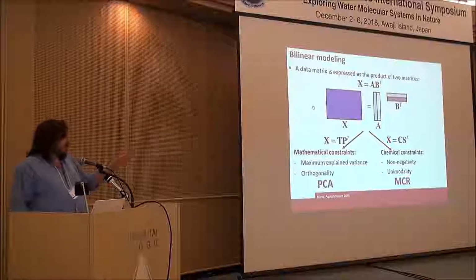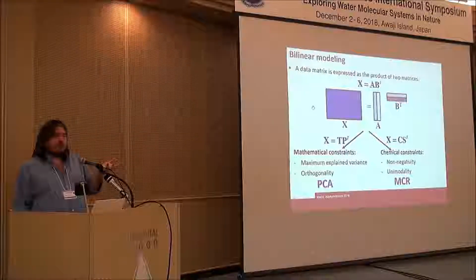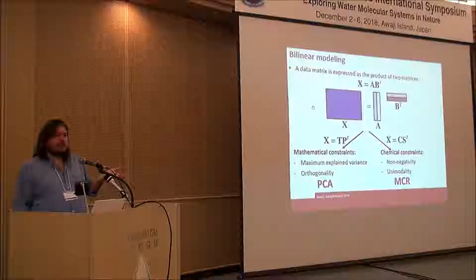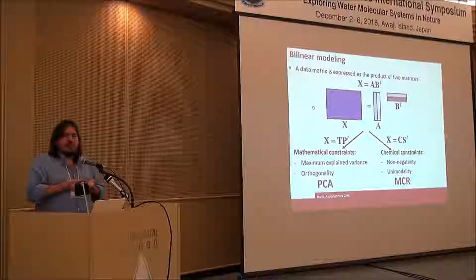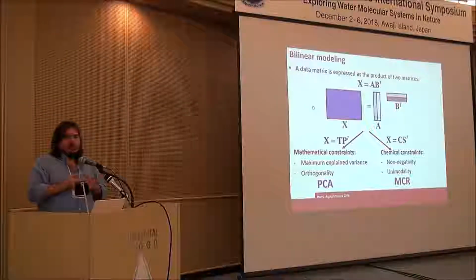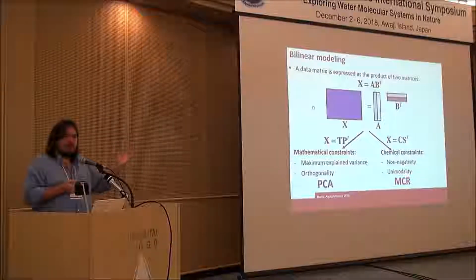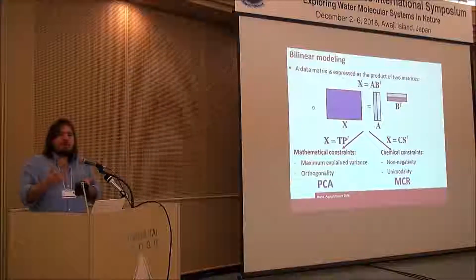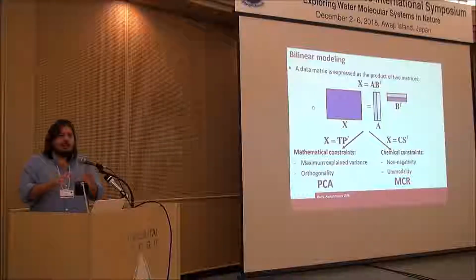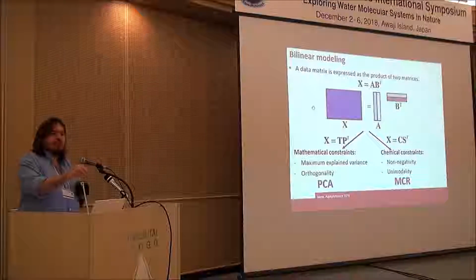And when it started, multivariate curve resolution was using as an informative source just non-negativity. Non-negativity holds for the greater majority of chemical and spectroscopic data, not for all, of course. If we think of circular dichroism, just to cite one, we cannot take it into account. But non-negativity of spectral profiles and concentration is the minimum chemical constraint that we can input in most of our data.